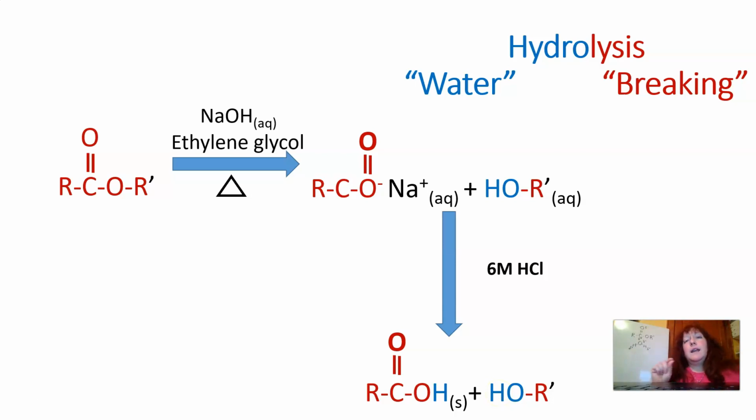Okay. When we get into the lab, we do things to make sure that the reactions go most efficiently and make the furthest amount of product that we can possibly make. So water and an ester eventually, to some extent, would react, but we don't want eventually and to some extent. We really want to get as much product as we can within the 3 hours that we got. So we're going to do a couple things to make that happen.